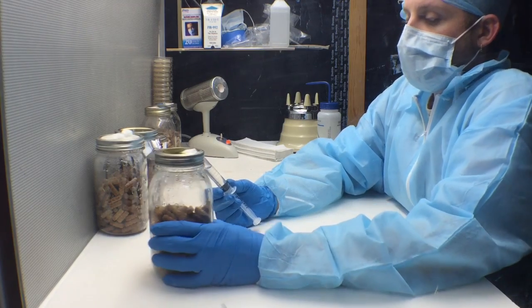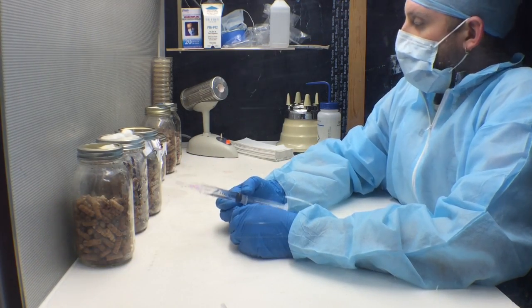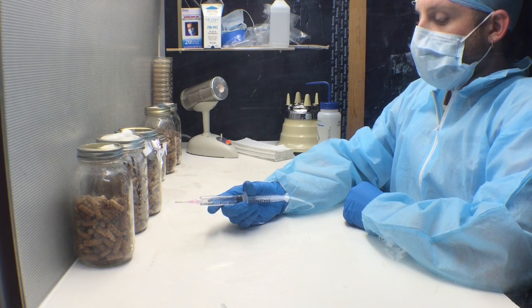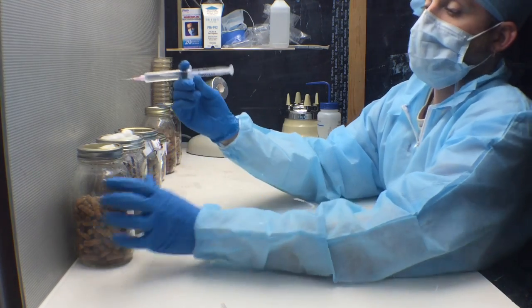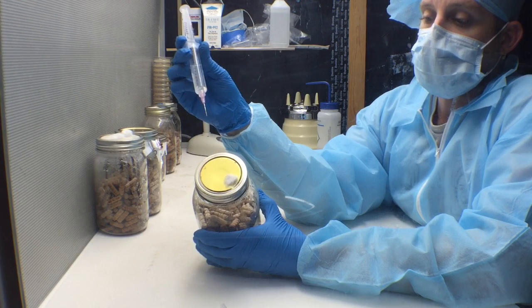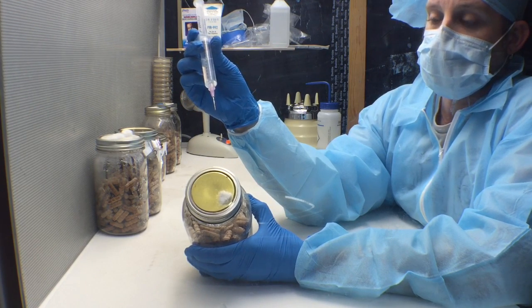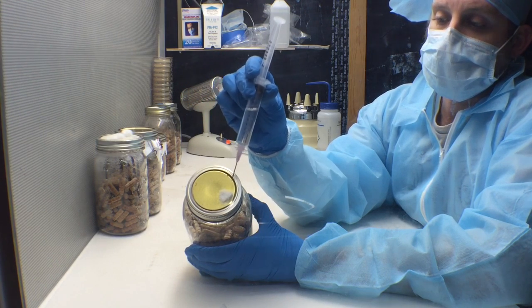Once you have your jars lined up in front of your flow hood and the tin foil removed, you can now start to inoculate your wooden dowels with your liquid culture syringe. This jar has been fitted with a filter made from polyfill, just by putting a hole into the cap and inserting the polyfill.